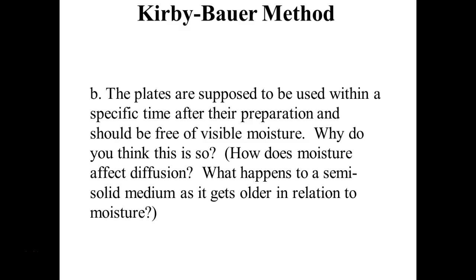So the plates are supposed to be used within a specific time after the preparation and should be free of visible moisture. Why would you be worried about moisture? I actually had to throw out some plates because they were too moist. Remember, we're dealing with what? Diffusion. And so if they're too moist, how is that going to affect the diffusion? Is it going to make it more or less? It's going to make it more. Actually, a wet paper towel, if you drop some dye on it, right, the water absorbs the dye and it'll spread.